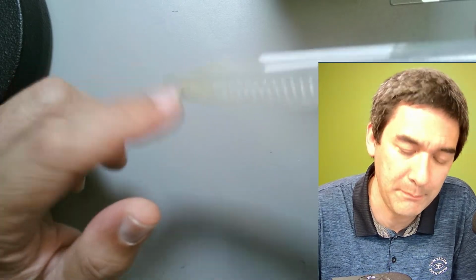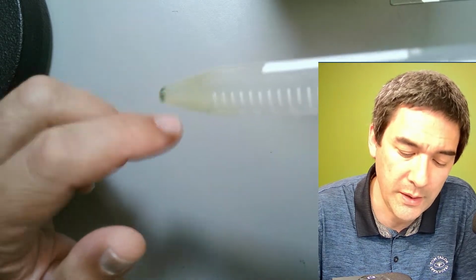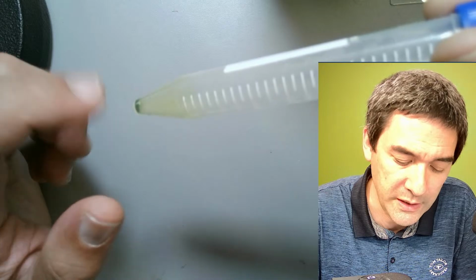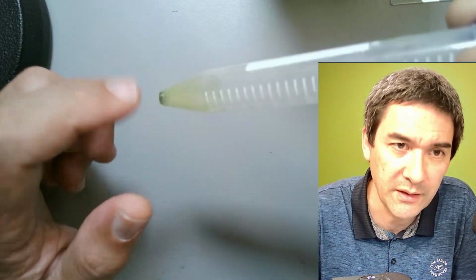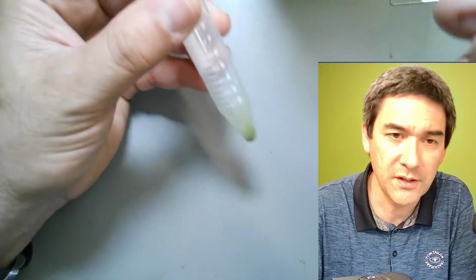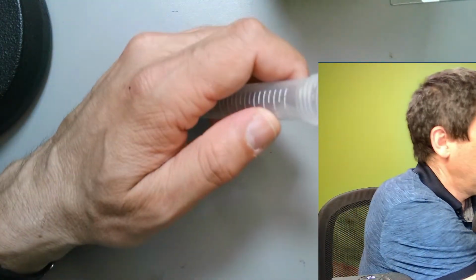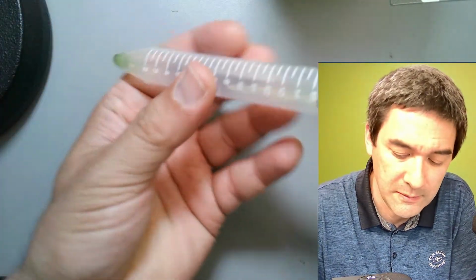Okay, so what I do right now is I kind of tap it and I try to dissolve it, and this way I've increased the concentration quite significantly, and I hope that we're able to find something interesting. If this resuspending takes too much energy and time and patience, then we can also resuspend it using a pipette.